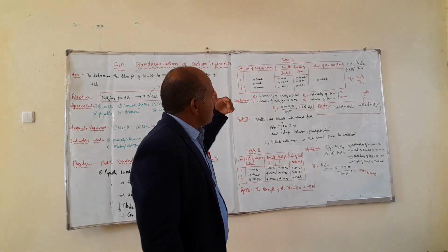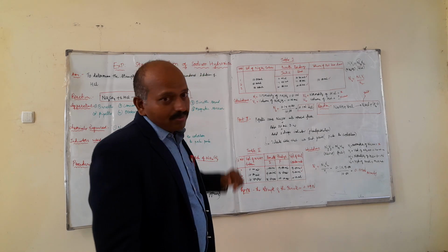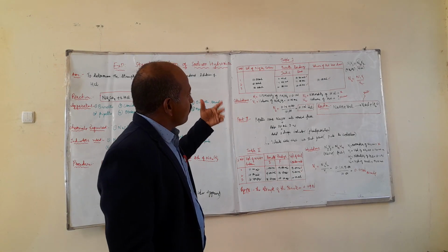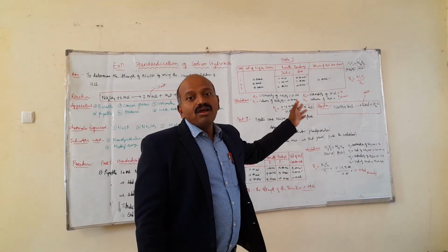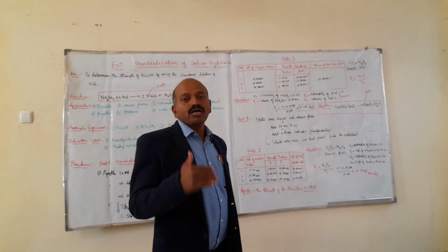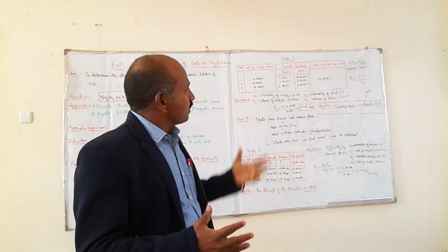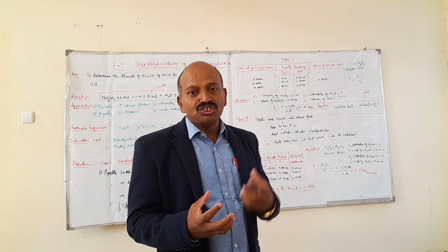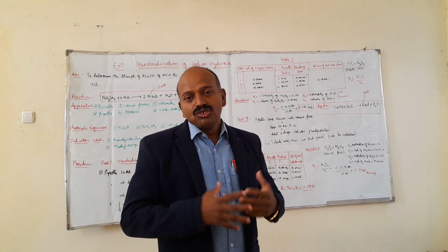And the second titration, the initial value will be 10 ml, and then it goes up to 11 ml. Suppose it is 11 ml, second titration. And in the third titration, the initial value will be 21 ml, and if you got 10 ml again, 3 values will be reported. From these 3 values, we have to check which values are concurrent, consecutive. The first value and the third value are concurrent, so we can take 10 ml as the final value. That is, 10 ml of hydrochloric acid is consumed by sodium carbonate to convert that base into neutral.